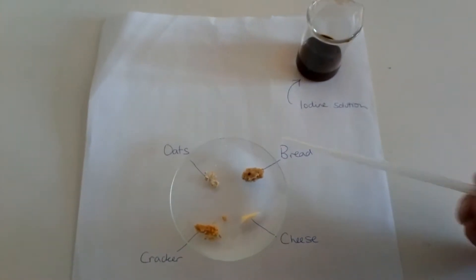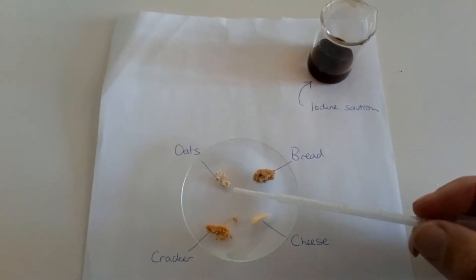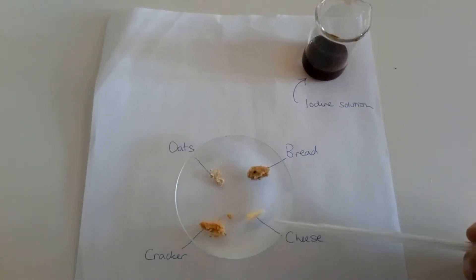I've got on the dish here some bread, some oats, a bit of cracker, and a bit of cheese.